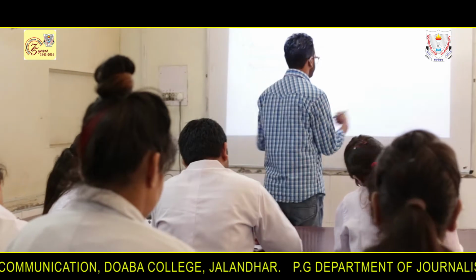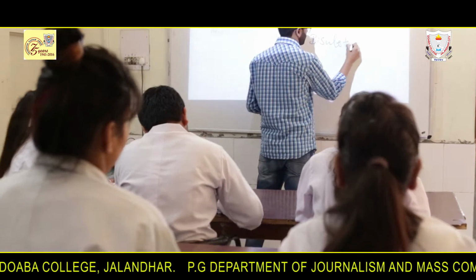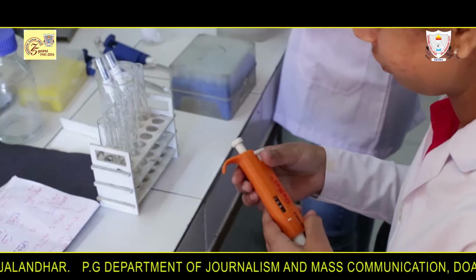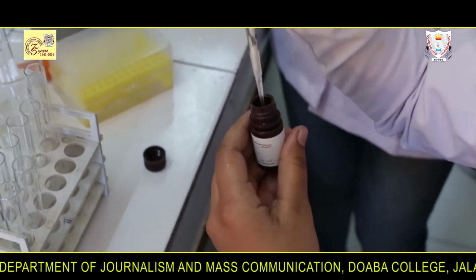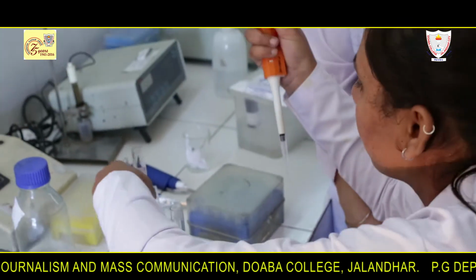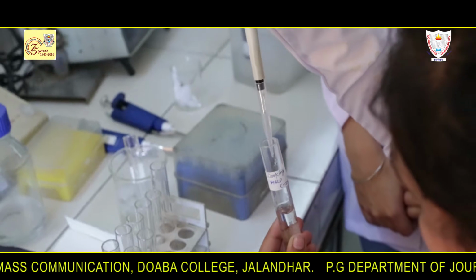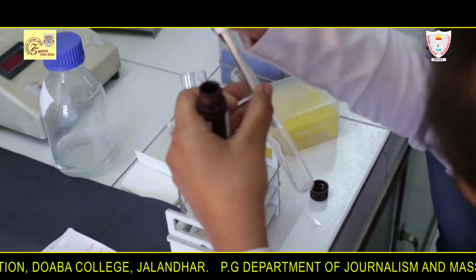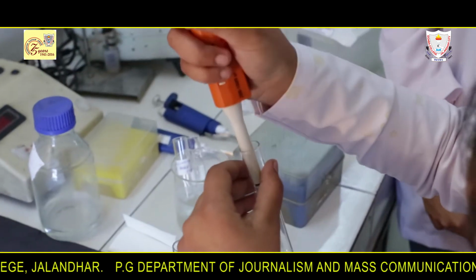Step 2. Effect of enzyme concentration. Again, there are 2 types of tests. Perform 2 tests, one with double the amount of enzyme and another with half the amount of enzyme. Prepare blanks separately for test A and test B since they contain double the amount and half the amount of enzyme respectively. Test A. Double the amount of enzyme.